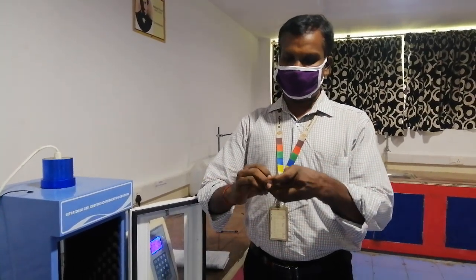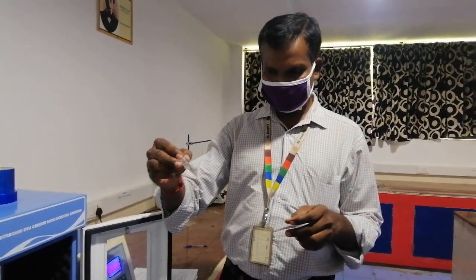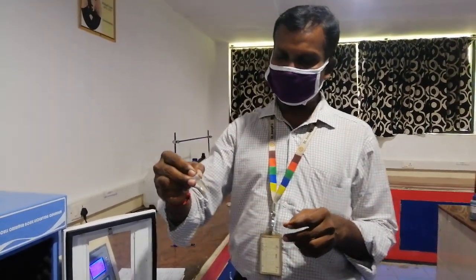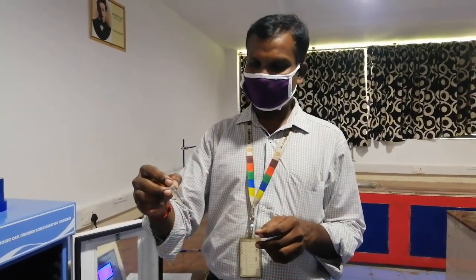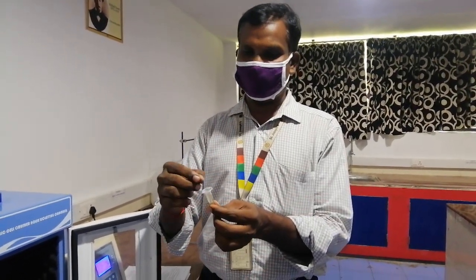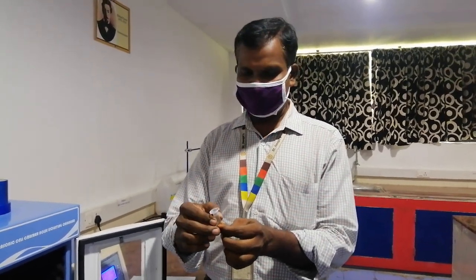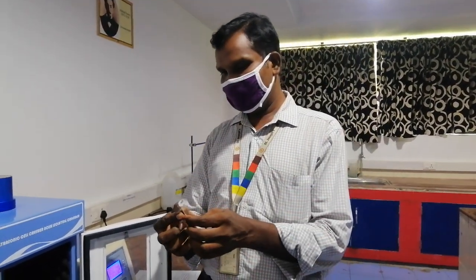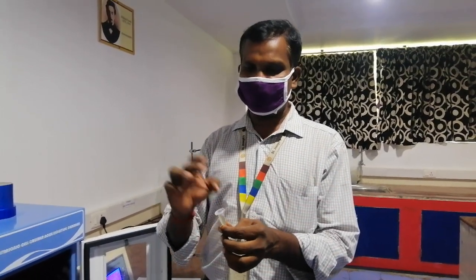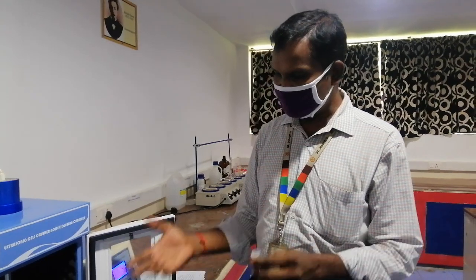I have collected approximately 1 ml of sample after the first cycle. This is supposed to be centrifuged before finding the protein concentration. So centrifuge the sample. After centrifugation, take 20 microliters of this filtrate, the supernatant. Mix it with 2 ml of Bradford reagent, incubate at 37 degrees Celsius for 10 minutes, and then take the OD for protein at 595 nanometers. Then using a standard, we can convert the OD into the concentration of protein. Then we should go for the second cycle.